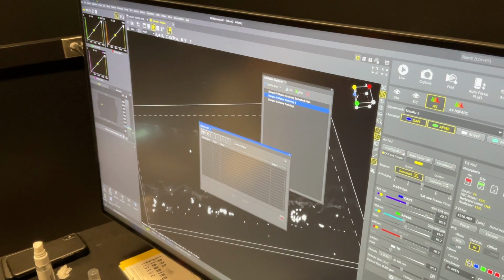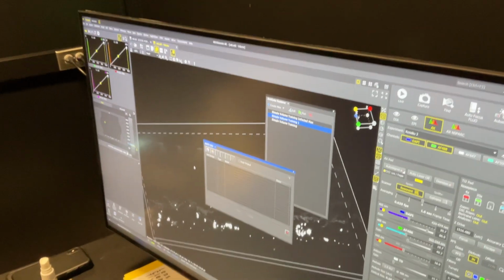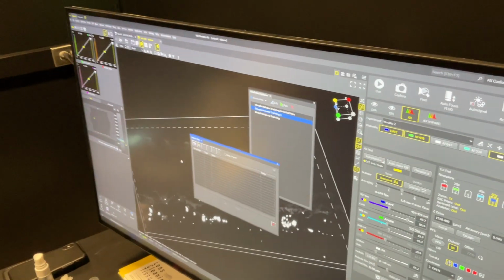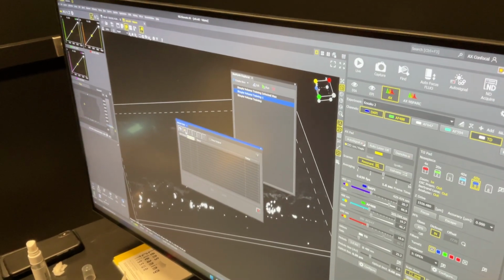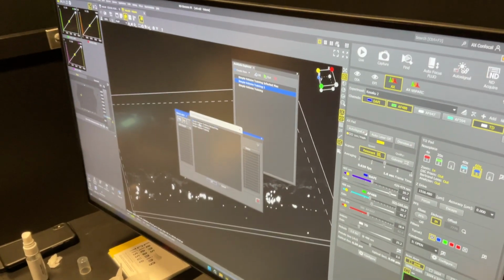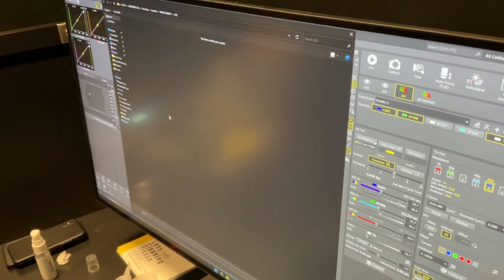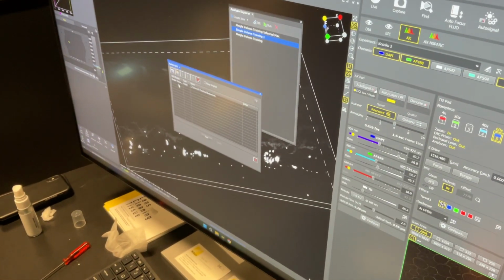Batch is very cool because you only have this system. You don't have a workstation for analysis, so you don't want to tie it up for imaging purposes. With batch GA3, you can load up either individual images or folders, and then tell it which GA3 you want to run. You point it to the folder.